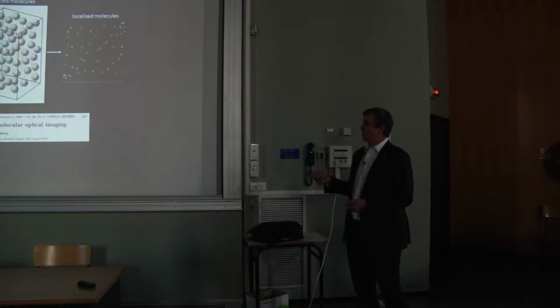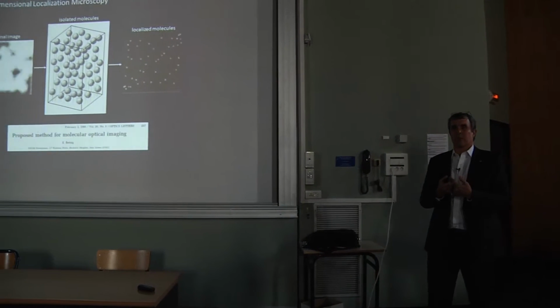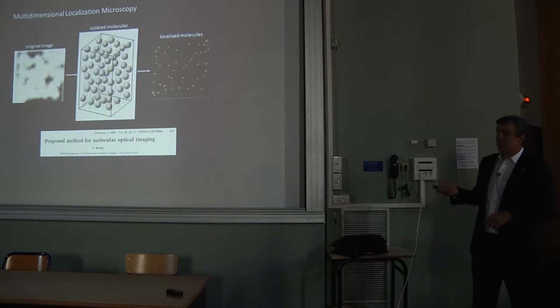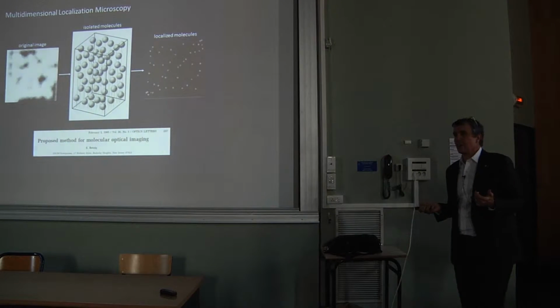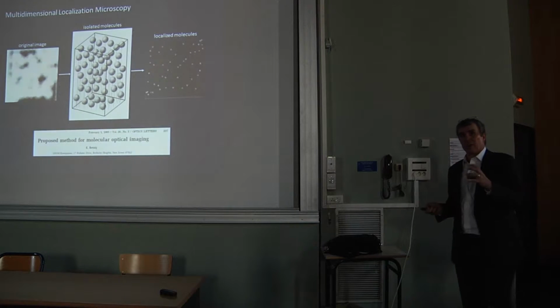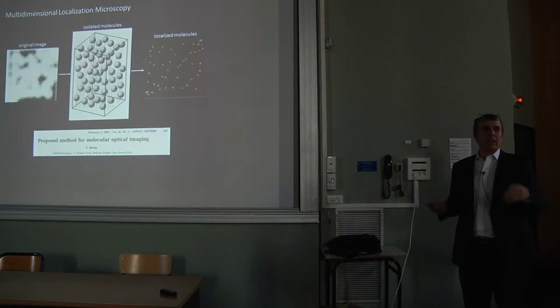So I had several forays in trying to do super resolution. The one that finally worked reasonably well was that if the problem is that the molecules in the sample are so close together that the fuzzy blobs created by each molecule overlap, what if the light from each molecule was somehow different? For example, if all those molecules glowed in different colors. Then if we had a spectrometer on there, we could isolate them in a higher dimensional space. But once the molecules were isolated from one another, it's relatively easy to fit a function to that big fuzzy blob and find the center of that function to much better precision than the diameter of the fuzzy blob.